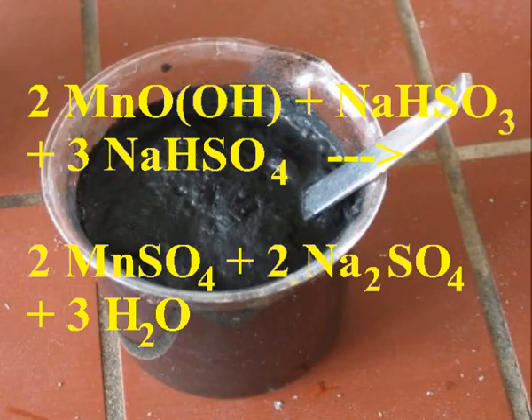Digest the black filter cake in this solution overnight and cover the vessel to prevent sulfur dioxide from escaping. The manganese oxide will dissolve.